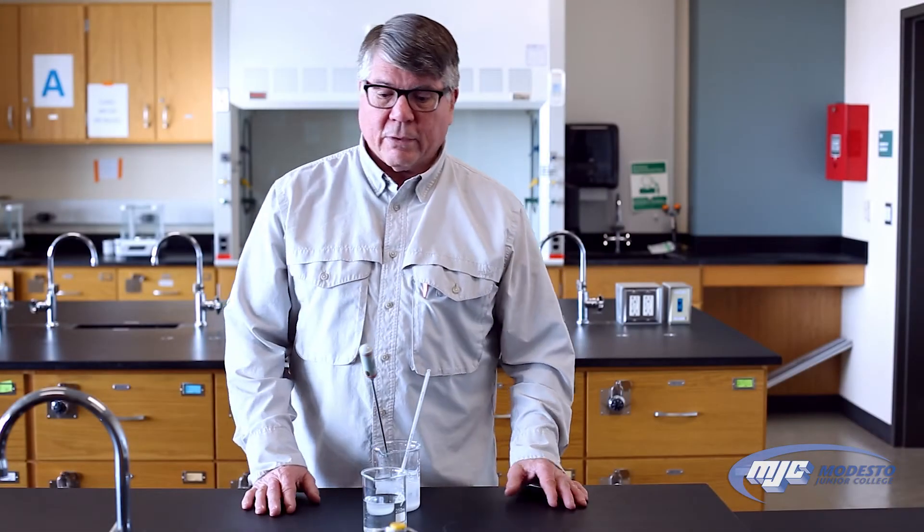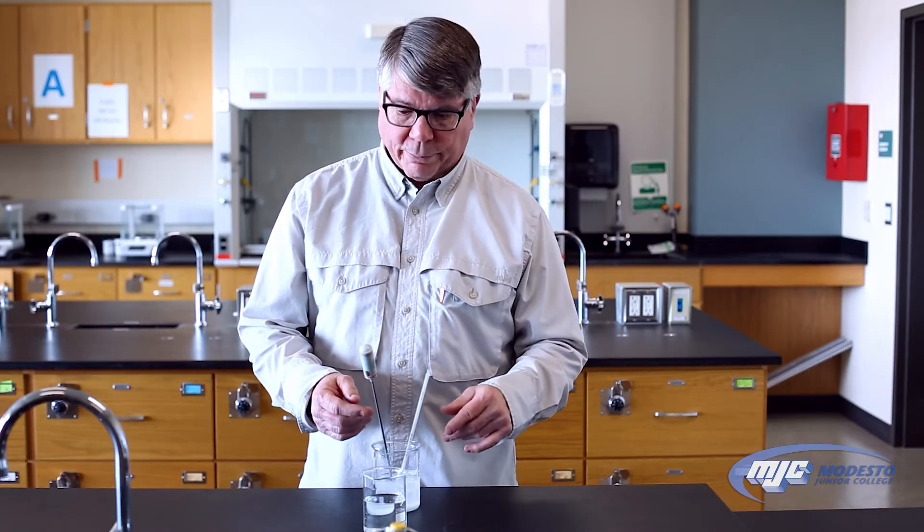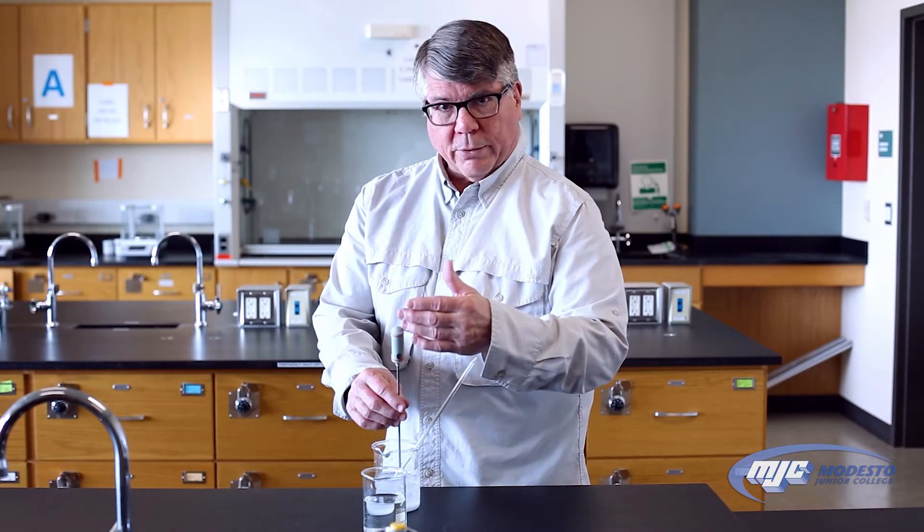Hey guys, this is an explanation of how to read the two types of thermometers that we use in chemistry labs here. There's a glass thermometer and then there's a digital thermometer.